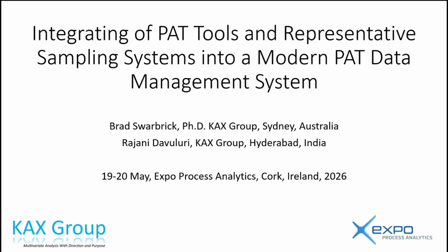I'm talking about going back to 2002 when we were first implementing some of our PAT solutions. There was very little networking in a company. Your hard drive space was probably about 256 gigabytes, and that was if you had a procurement department that wanted to spend the money. And so we were learning everything from scratch. Today, we've got it really good. We've got databases, we've got fast instruments.